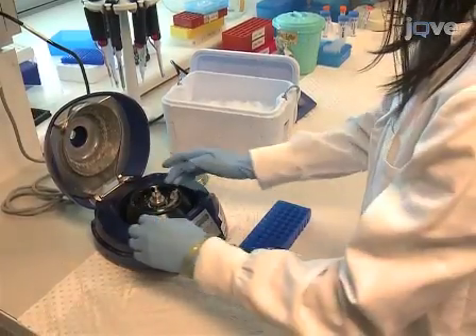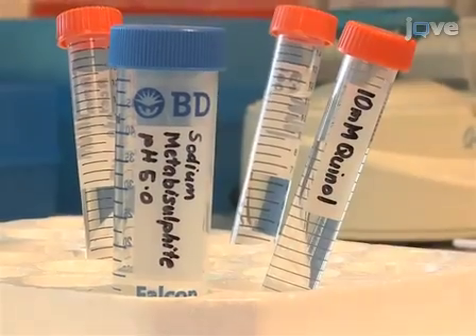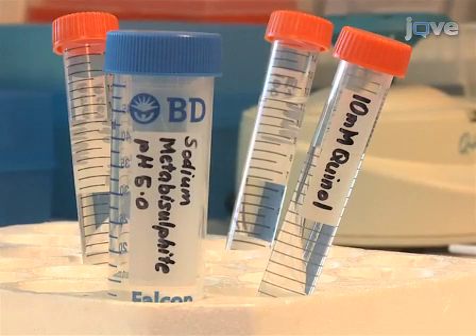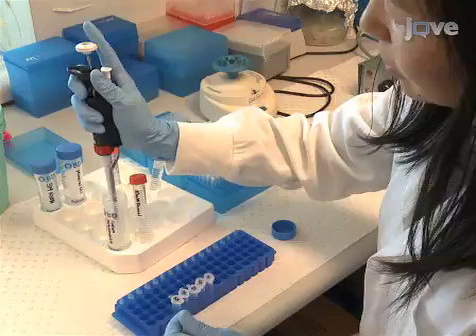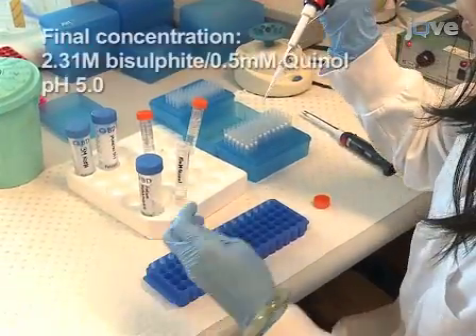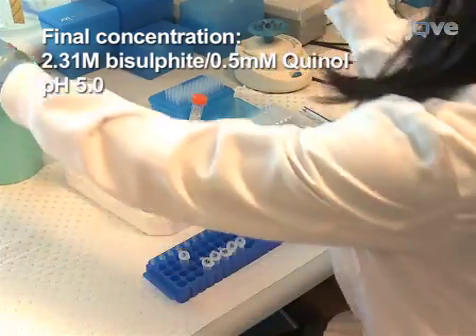Prior to the sulfonation and hydrolytic deamination reactions, prepare fresh solutions of 10 millimolar quinol and saturated sodium metabisulphite. As the sodium metabisulphite is the saturated solution, small lumps may remain undissolved. Add the sodium metabisulphite and quinol to the denatured DNA in a final volume of 240 microliters.